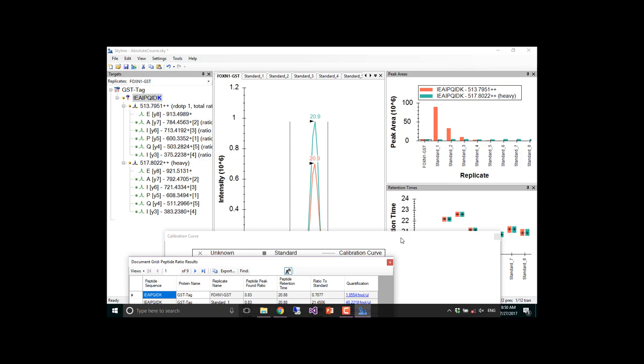Yeah. So it's rounded to 1.5, but the second is not right. It keeps changing. So what's the true value? Like, how do I know what the actual value is? Where should I do the integration, or should I just trust what was done automatically?